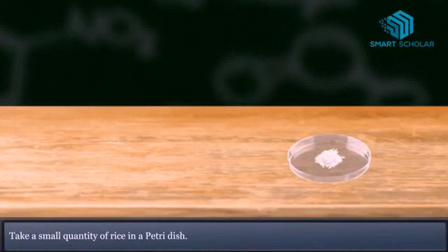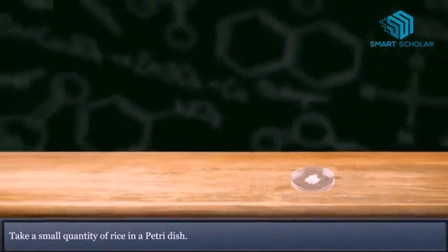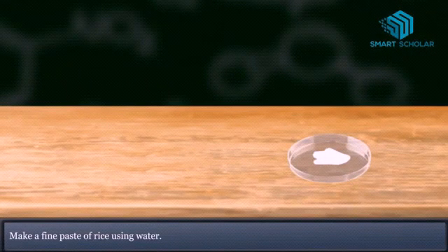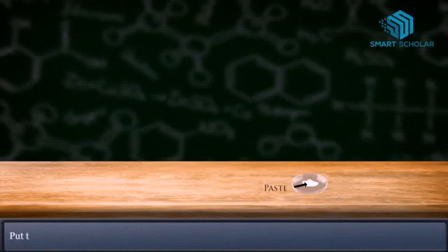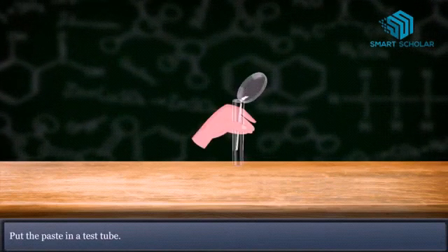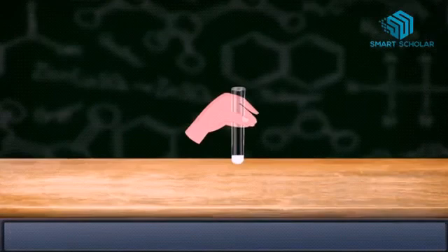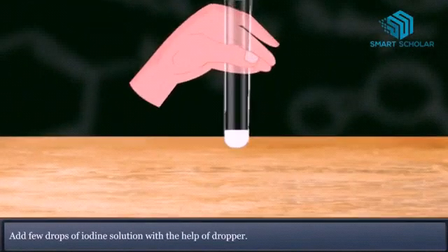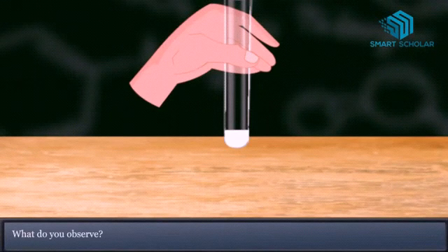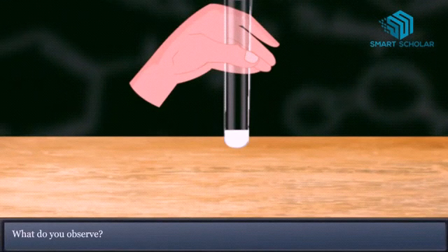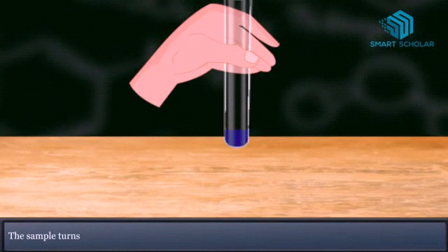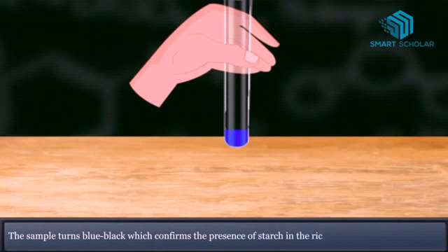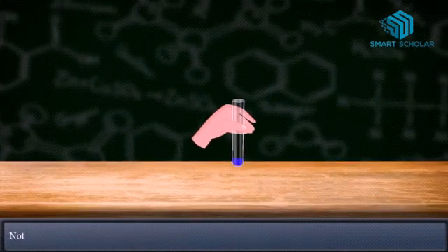Take a small quantity of rice in a petri dish, add some water and make it into a paste. Transfer this paste into a test tube. Very carefully add a few drops of iodine solution with the help of a dropper. Let us wait for the change. What do we observe? The sample turns blue-black in color, which confirms the presence of starch in the rice.